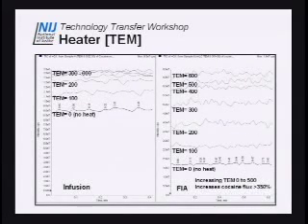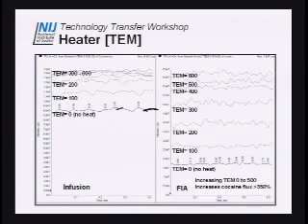Temperature, and here's where you're going to see a huge difference between just no temperature. I don't need that. I'm concerned that my drug might fall apart because of temperature. You don't need to be that concerned because the volatile mobile phase is coming off, and that's what's keeping things cool for your sample, for your analyte. And it pops right out of the gas into the gas phase and gets sucked right into the mass spectrometer. You can see on this side infusion, there is a difference between a temperature off here at 9 e to the 7 and here at 1.3 times 10 to the 8th, which is a lot.